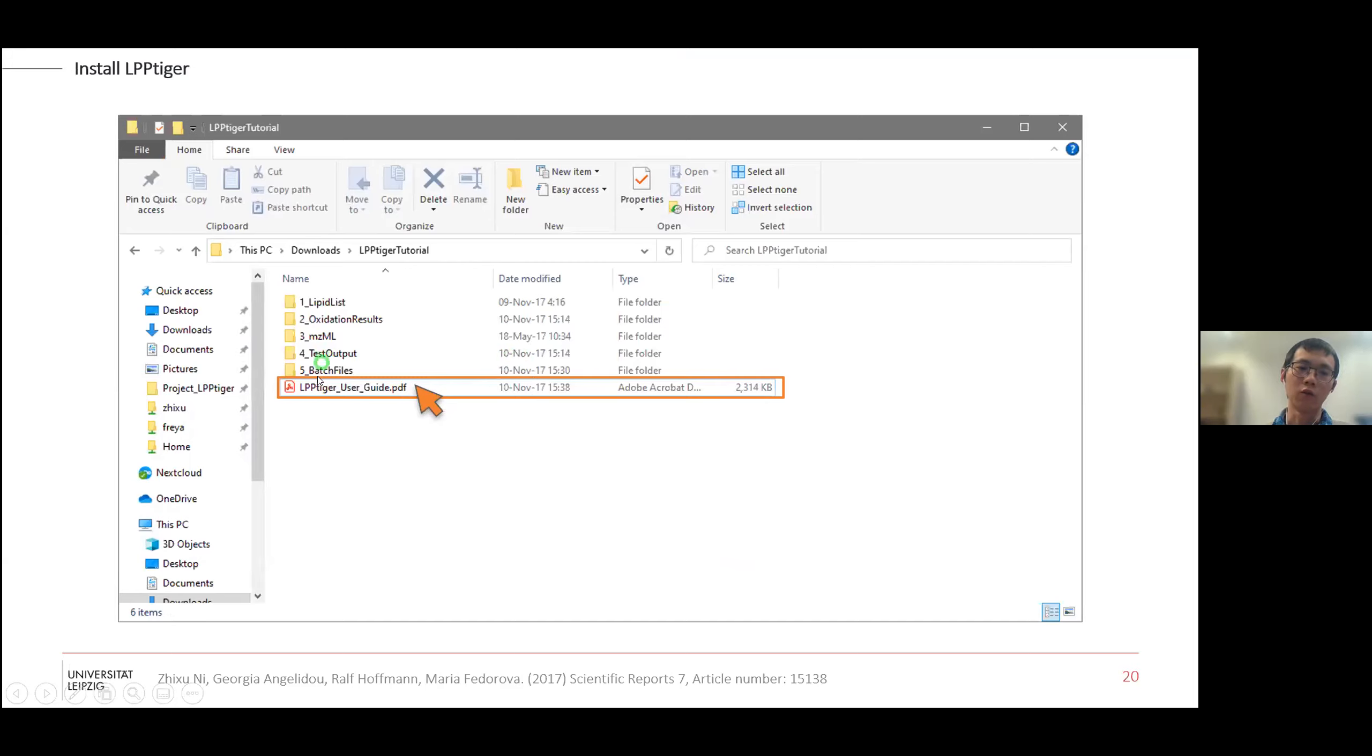If you download the tutorial package and the user guide, you get a list of folders. This includes step-by-step user guide with screenshots and examples. In each folder we have the sample files and sample output from each step. Today I will give you just a short overview of how it will work, and then you can download this tutorial pack and try it yourself.